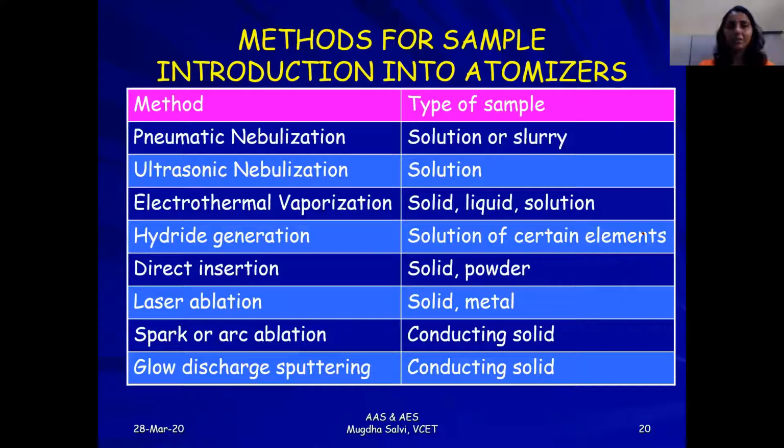These are some of the methods: pneumatic, ultrasonic, electrothermal, hydride generation, direct insertion, laser, spark, glow, and for which type of materials it can be used. You can use it for solutions as well as powders as well as solids.